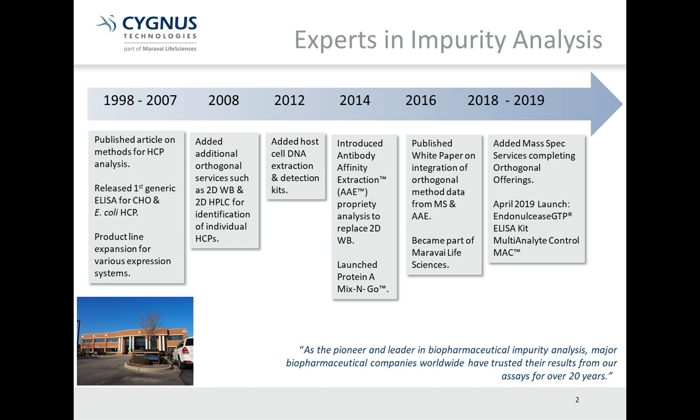We spent a lot of time in the past few years working on the integration of AAE and mass spec into host cell protein analytics. I plan to spend the next few minutes describing this work and will hopefully illustrate the importance of truly understanding the HCPs that are in your process.